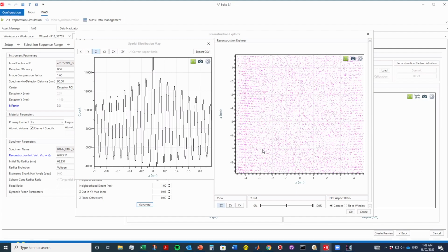Okay, yeah. Thanks. I have a question that's maybe not going to you, Andrew, but I can see that Rob Alfig and Dave Reinhardt are already in the chat. All of what we've talked about so far was really wide-angle atom probes, where you can assume that all of the atoms are landing on a hemisphere, and everything is just shifted by the angle that the atoms land.